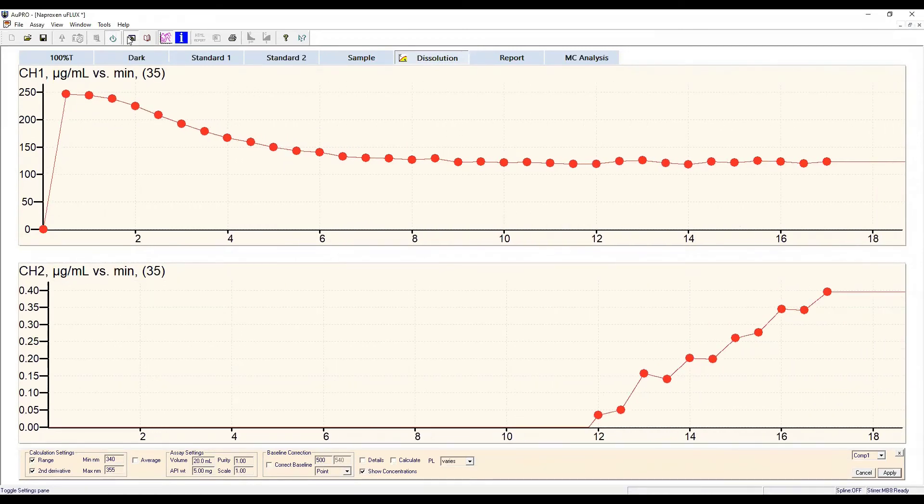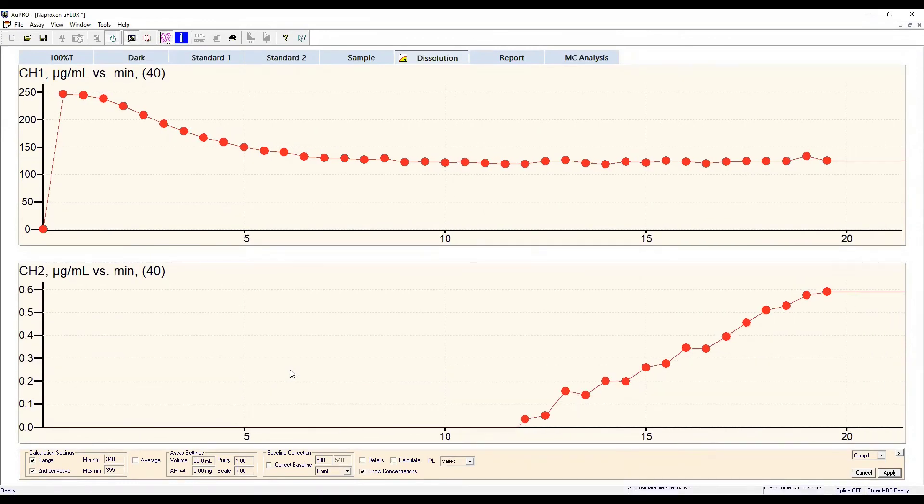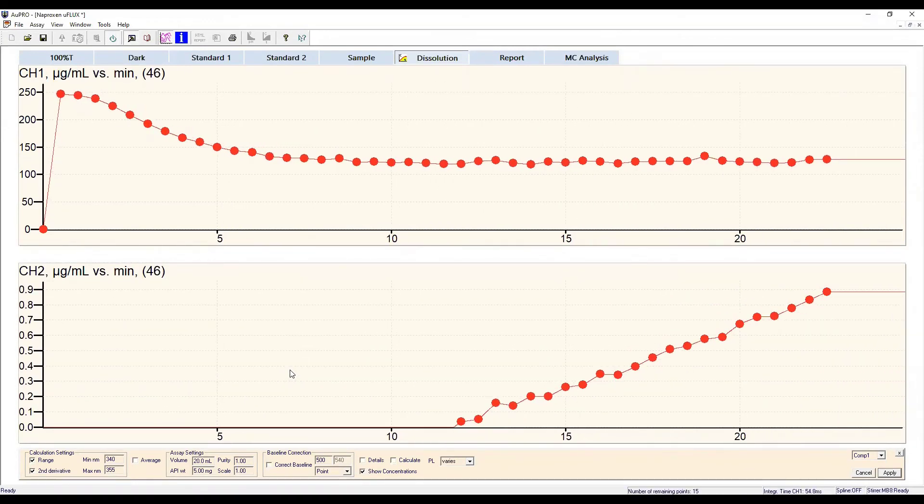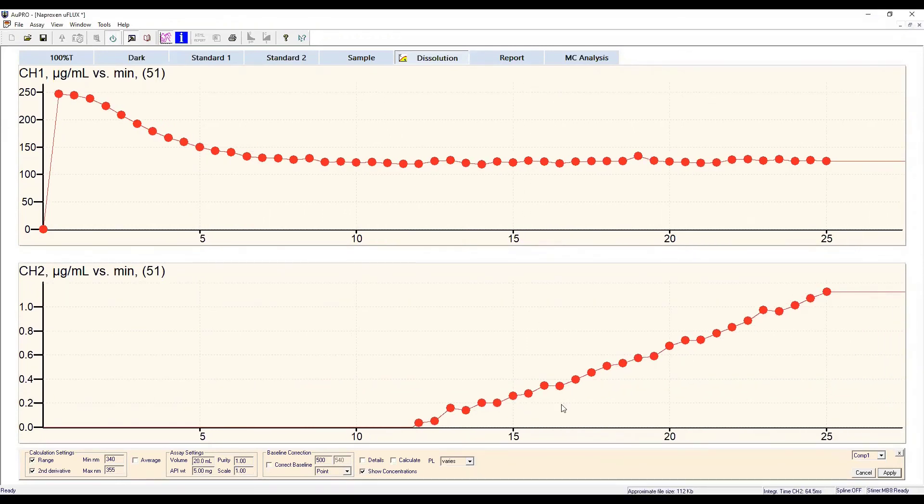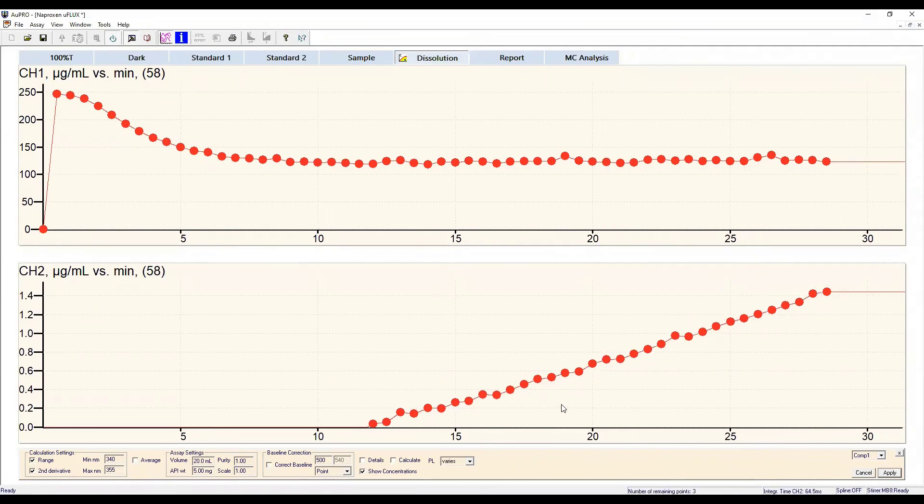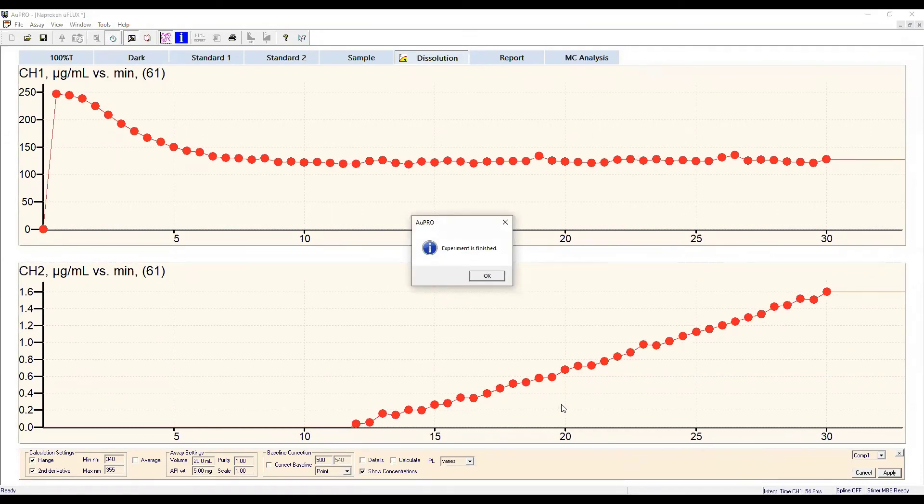There is a lag period associated with the movement of sample across the membrane, and it is not until 12 minutes that we start to see appearance of the sample in the acceptor chamber. Provided that sink conditions are maintained in the acceptor chamber and concentration is constant in the donor, the movement of sample across the membrane will be linear. Modeling of the appearance curve can also be performed in the software to obtain flux values, which represent the amount of sample crossing the membrane per unit time per unit of the membrane area, and are proportional to the gradient of the appearance curve seen here in the acceptor chamber.